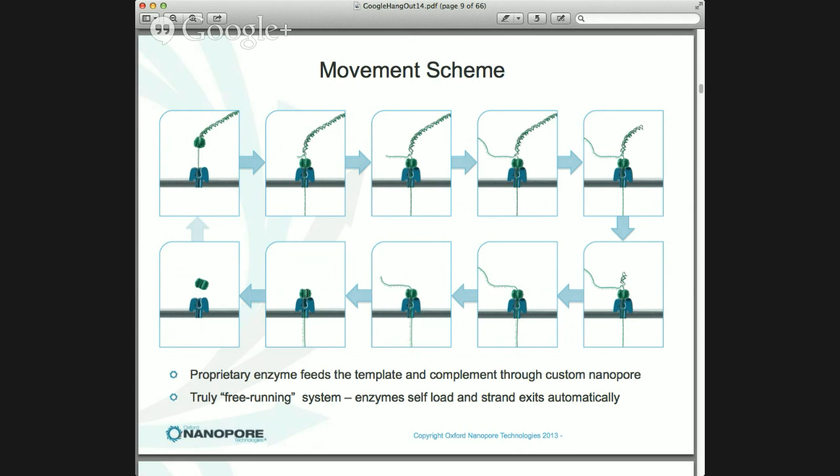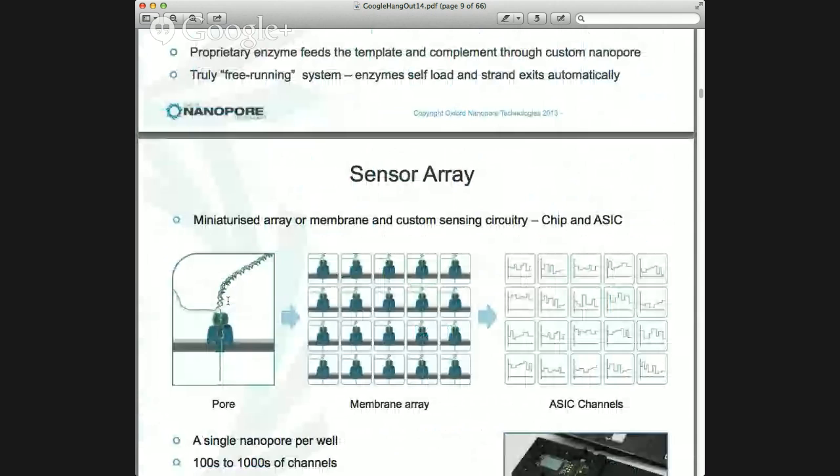And when that's finished, the whole complex dissociates and the pore becomes available again, it becomes open to accept a new molecule. So the system is constantly sampling from solution, and it's a streaming system. It's free running. It gets very different from other sequences that I'm aware of.